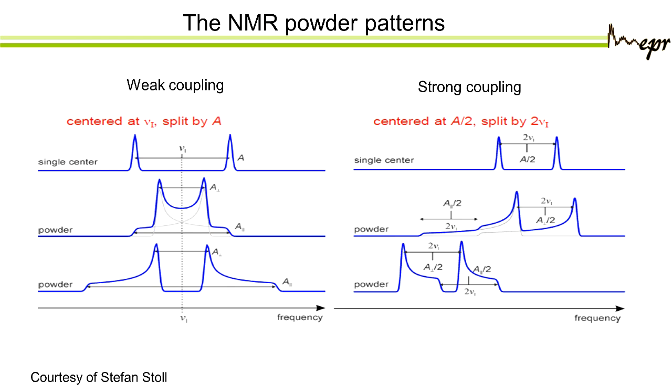And in the bottom, we have another example that is just with different parameters. But you see, often you have these nice line shapes where you can recognize the parallel and the perpendicular positions. Often it is axially symmetric. When it is not, then of course it gets a bit more complicated.